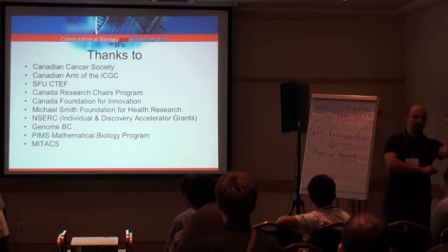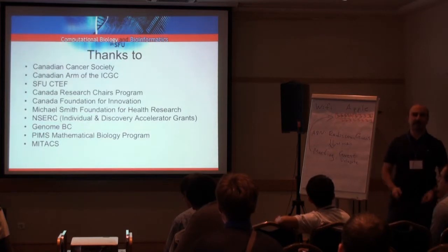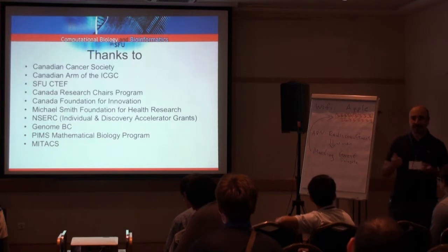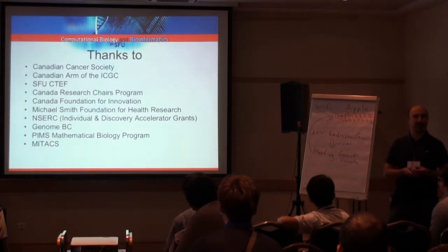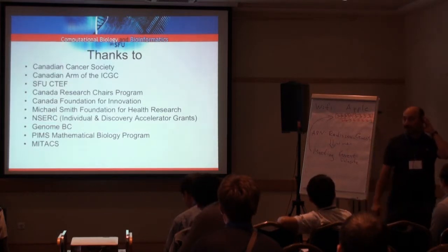Novel insert in one against the other, I can understand how they find it. But how are they going to find copy number variation? When copy number variation overlaps with, say, an inversion, how are they going to find any of those complex events? I don't see. I don't think that it's a solution to all the problems that they think they'll solve.